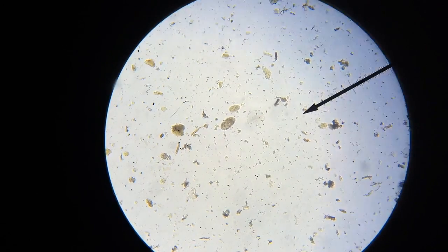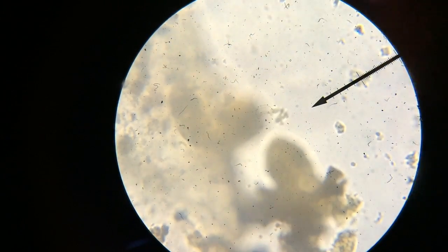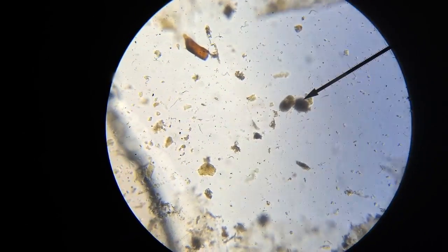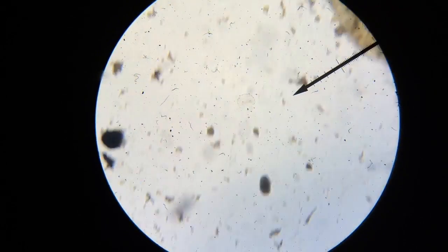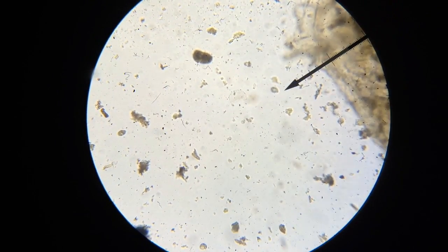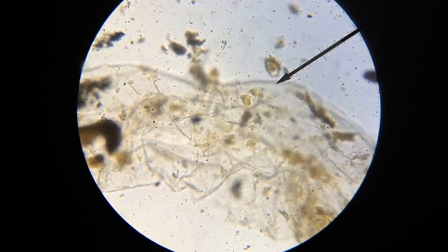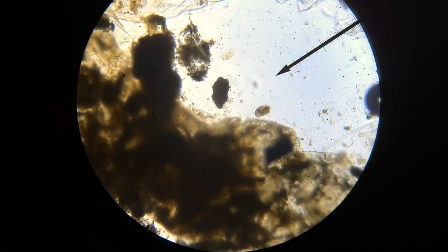Here we're examining the feces of the Gibiceps catfish and you can see these sort of oval shaped structures. You can see quite a few of them around now, so it makes me suspect that they're likely to be worm eggs. You can see there where the arrow is pointing, and if we scoot around you can see another one there — it's oval shaped. And over here what you can see is the ciliated protozoa. They're likely to be just commensals that live at the tank bottom; they munch things up and help break things down, so they're not a problem. But these oval shaped structures are concerning — to me they really resemble worm eggs.